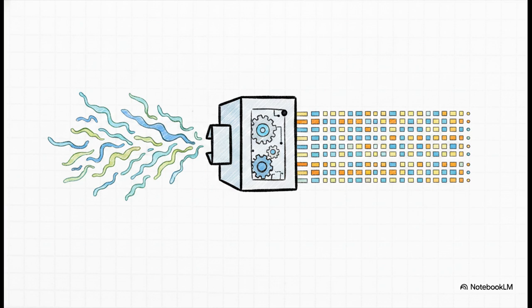Those isolated fragments are then prepped into a genomic library. We use next-generation sequencing, or NGS, to read these fragments, translating them into millions of short sequence reads. We've officially digitized our biological snapshot.